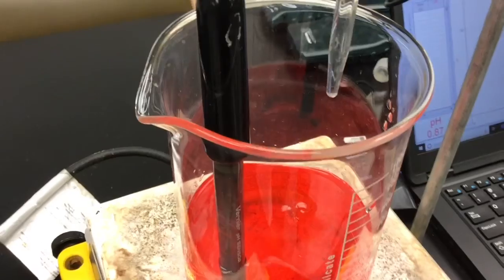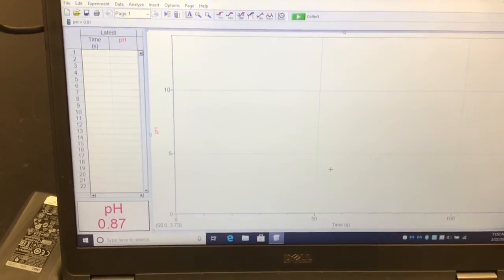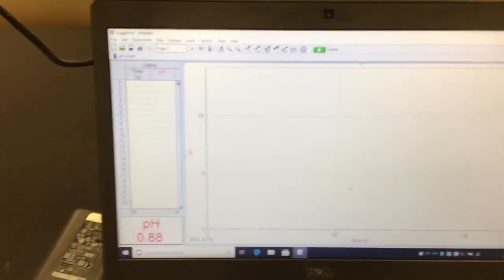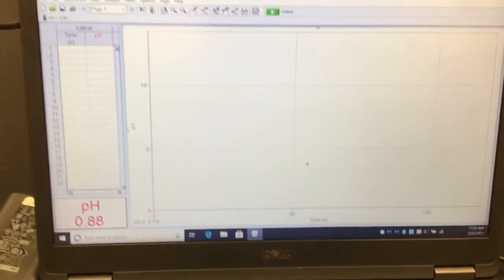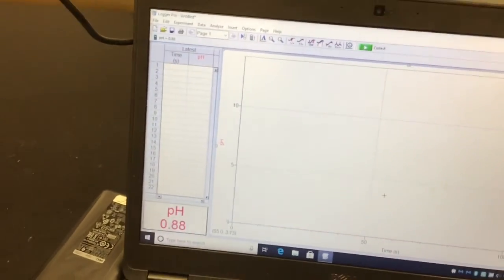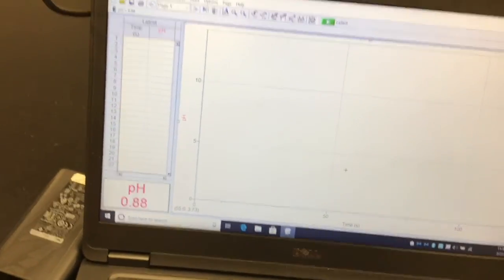Then we are going to watch the pH get graphed as a function of time. But again, please keep in mind that I am adding it at a constant rate. So what should this graph look like if I were to add this in at a constant rate? Think back to basic graphing skills from basic algebra. What kind of lines should I get if I'm adding things in at a constant rate?